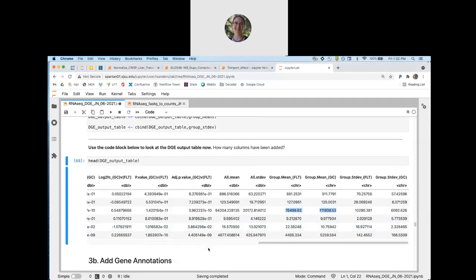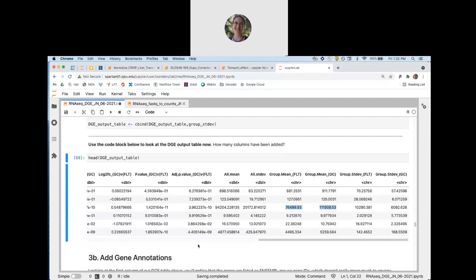All right. Did anybody not get this output? Not yet. Yeah, I was wondering about that, if perhaps having so many people running this at the same time could be bogging down the server.